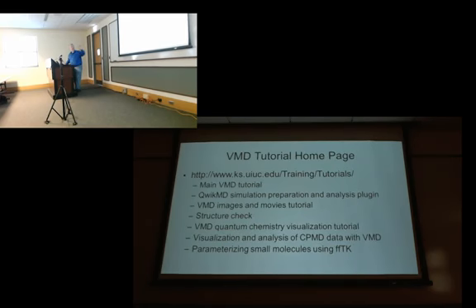Our VMD page has a large number of different tutorials, so you've been asked to go through one of them, I guess, today in the hands-on session, but there are actually quite a few other topics you may find interesting or valuable for your research, and these are just a sampling of them. The one you're going to go through today is the basics of VMD. It doesn't get into a lot of the deep capabilities of the program, but it gives you an overview of different features it has and the kinds of things you can do with it.